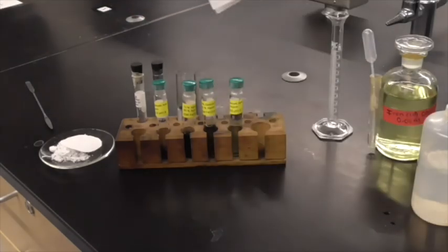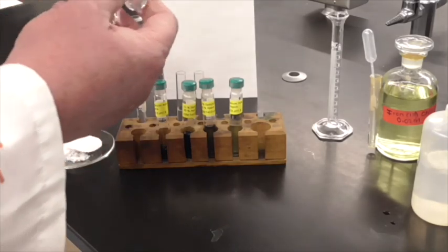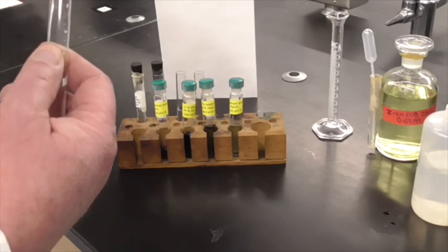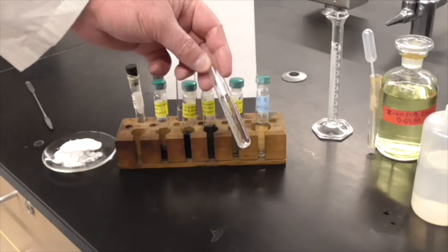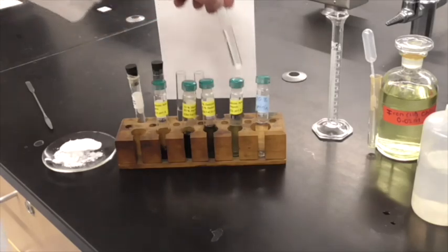Right, so we've done the reaction with salicylic acid and acetic anhydride to form aspirin, acetylsalicylic acid, and we got a pretty good yield of the aspirin, and we've got a pretty pure product. All right, that's all we got.